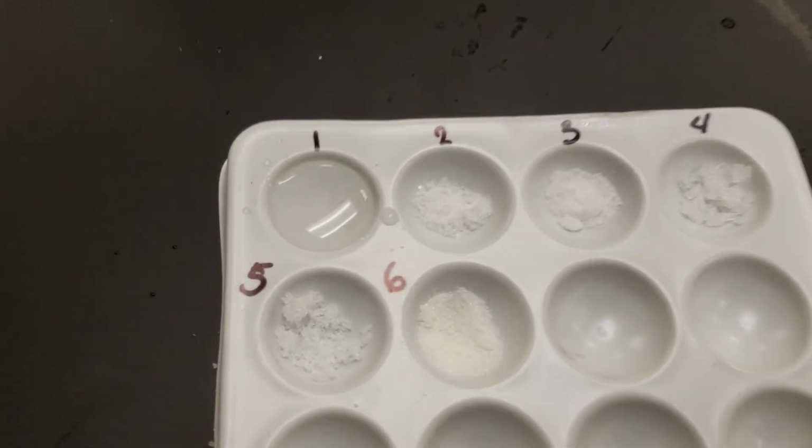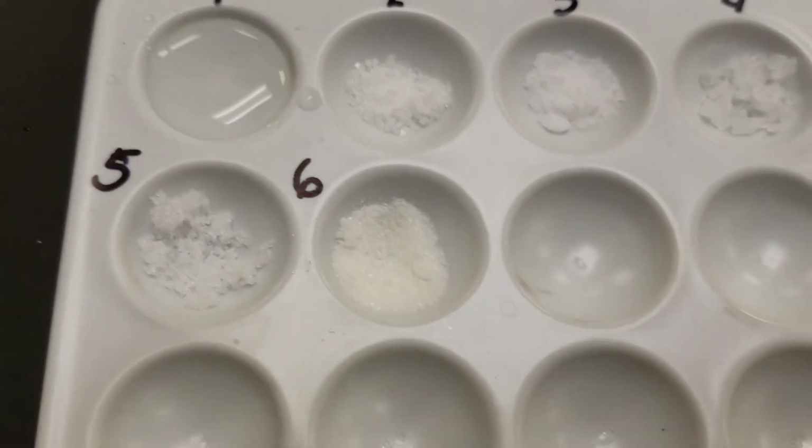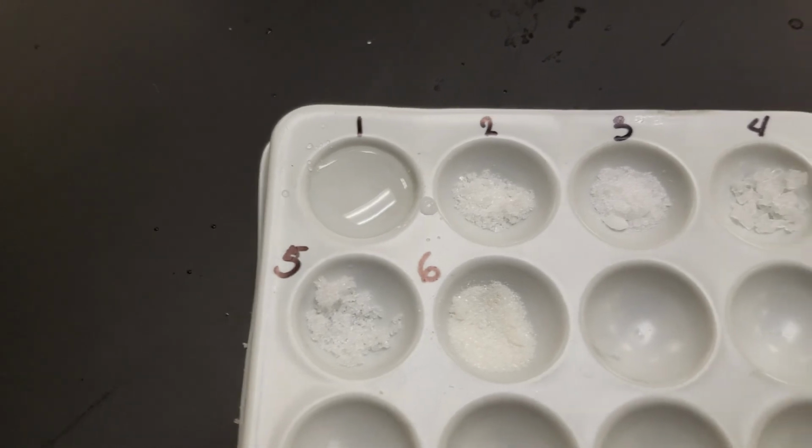Calcium chloride. It looks like it does dissolve completely. I don't see anything left.